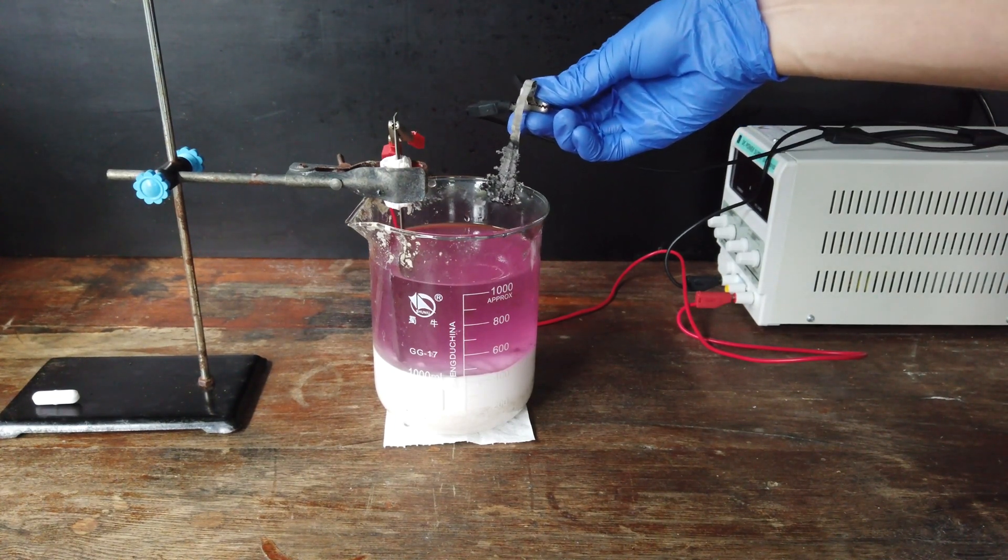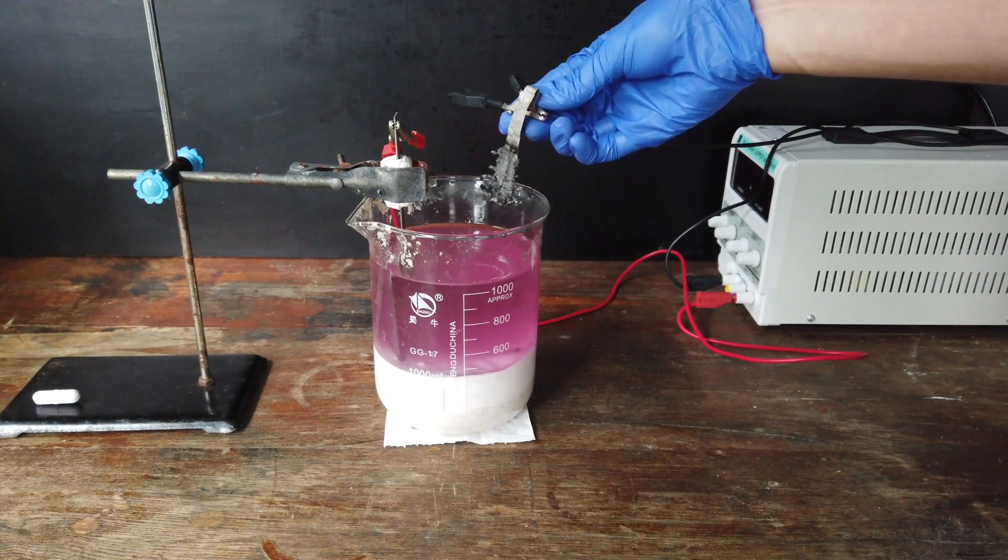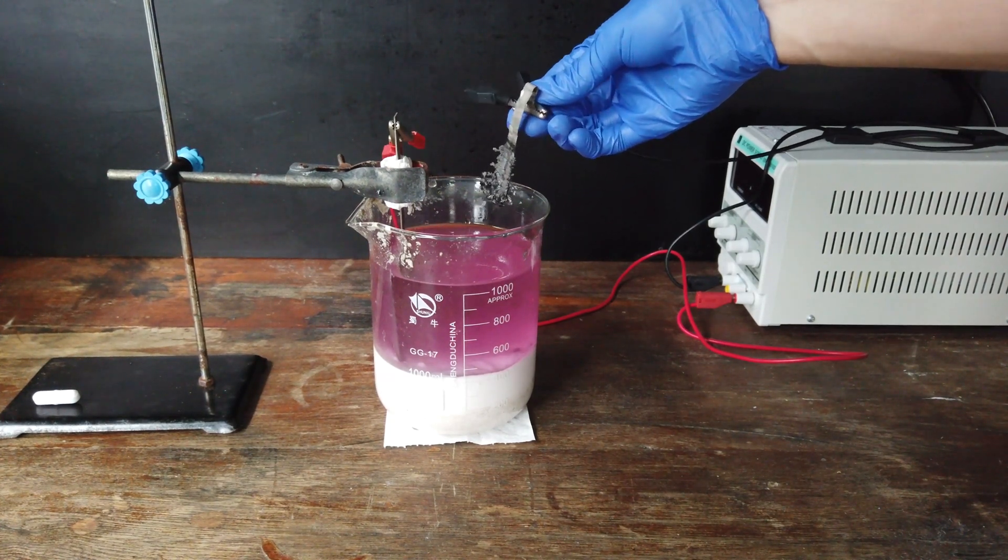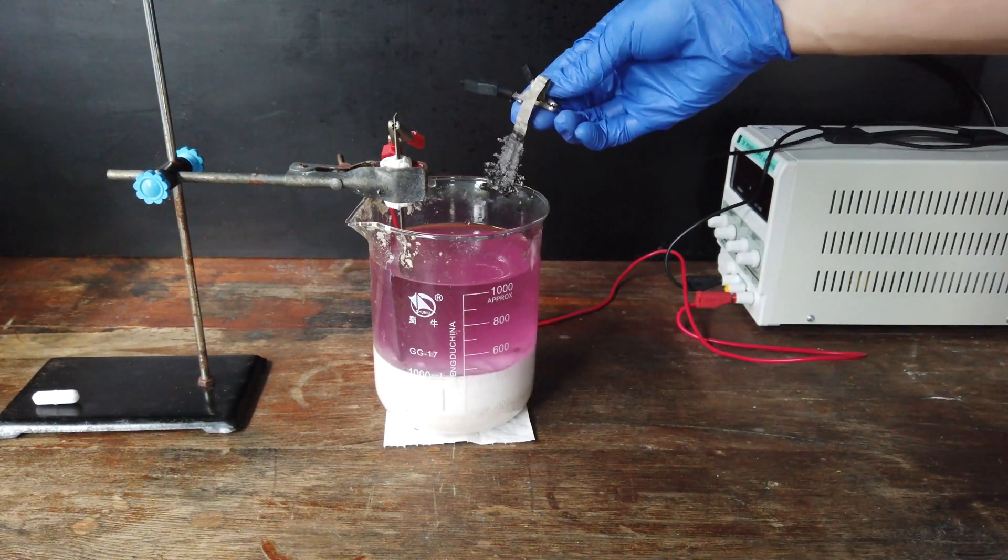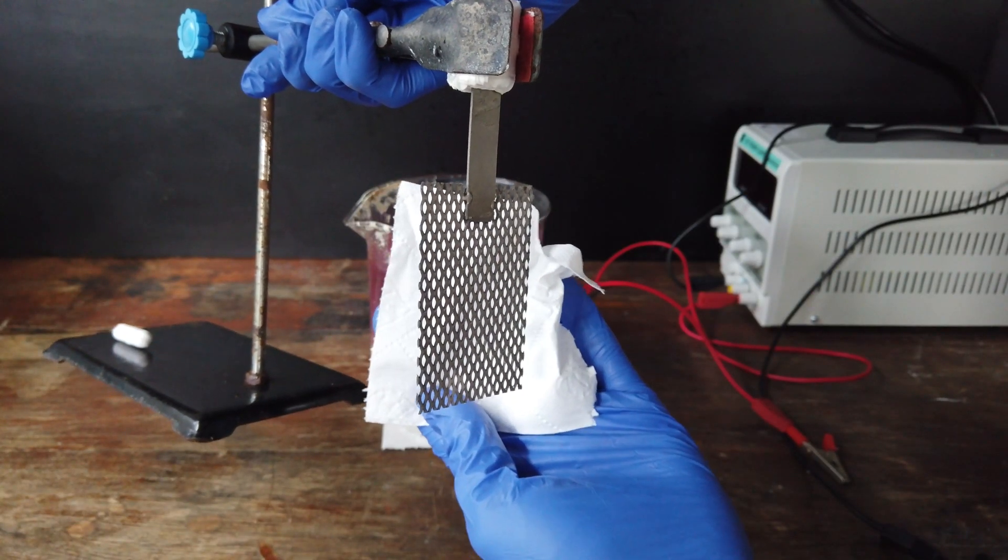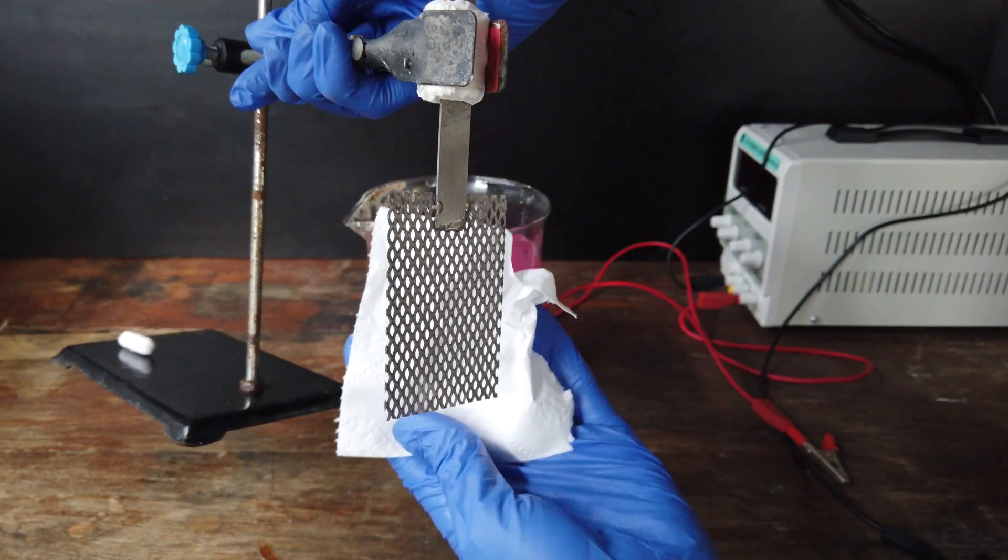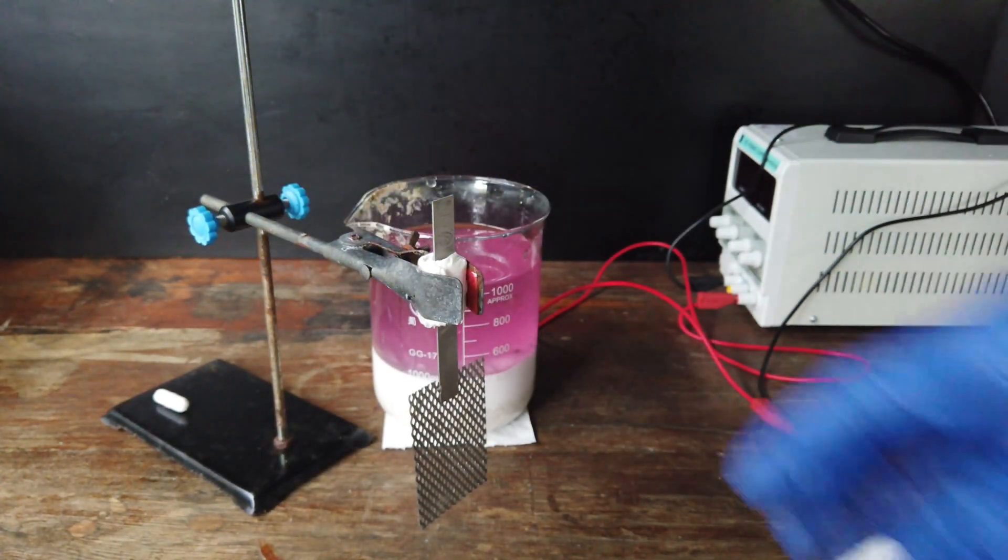Once again, we've grown trees of nickel and cobalt metal on our nickel electrode there. And I'm going to add those to our beaker full of metal that we've extracted. You can see our platinum electrode here is completely unscathed by the reaction. So, that just goes to show the inertness of the platinum electrode.